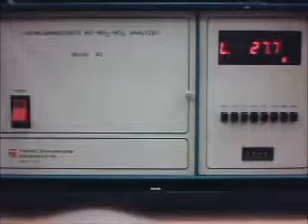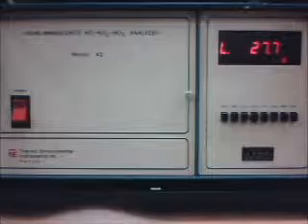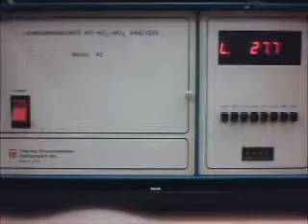The PMT analyzes the amount of light that's emitted, and from that you can measure the concentration of nitric oxide in the sample.